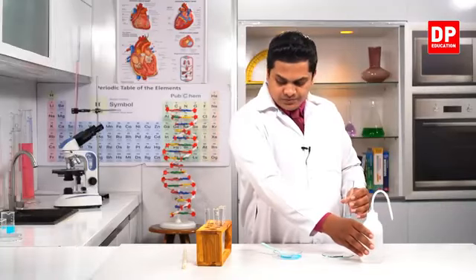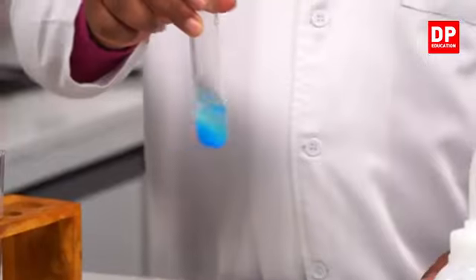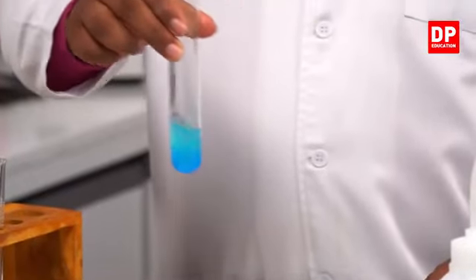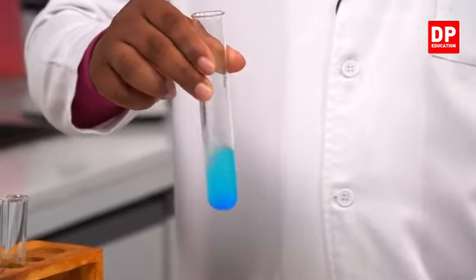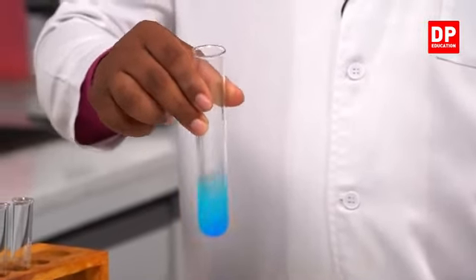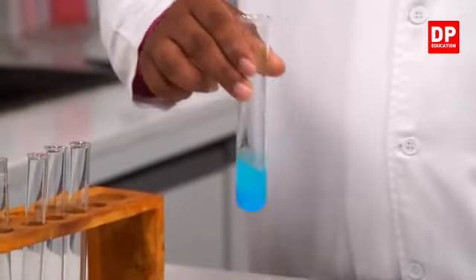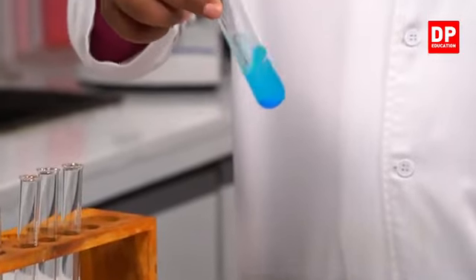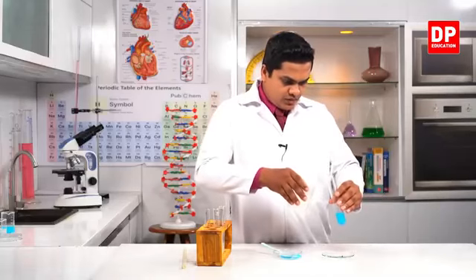And now let's mix it well. So let us add some more water.